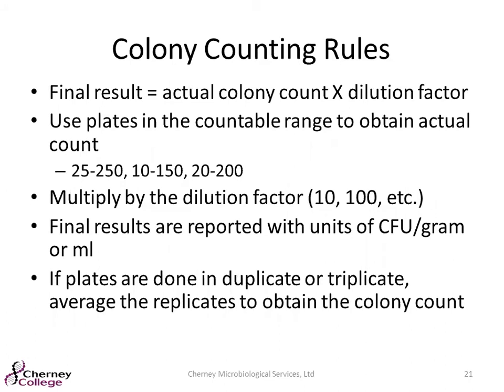And then after we count, the rounding is always going to be the final step. So we're going to take our count, which is the actual colony count, times the dilution factor. And if you get results from us, you may or may not see an estimated sign. That has a lot to do with the countable ranges. Every test, every bacteria method, will have different countable ranges based on the surface area, the bacteria that you're looking for, the size, the growth rate, all of those things.